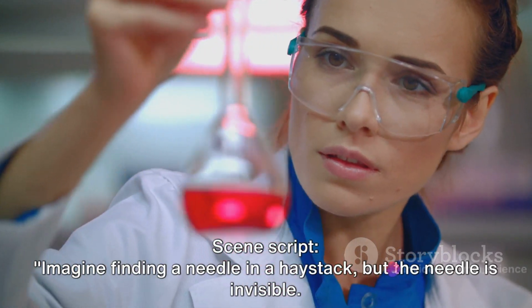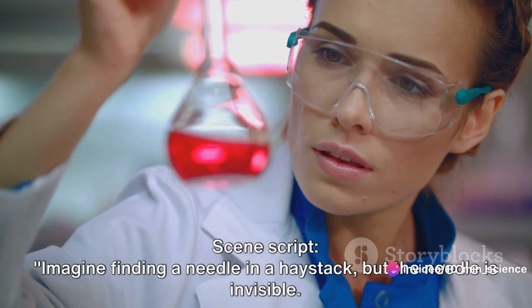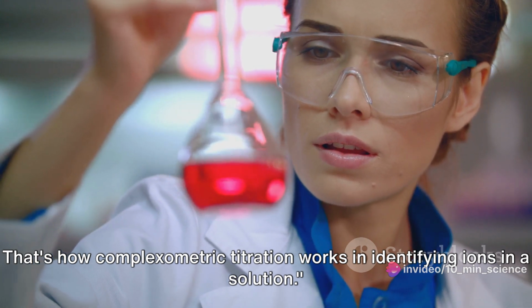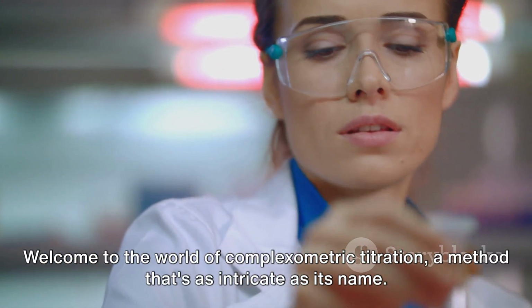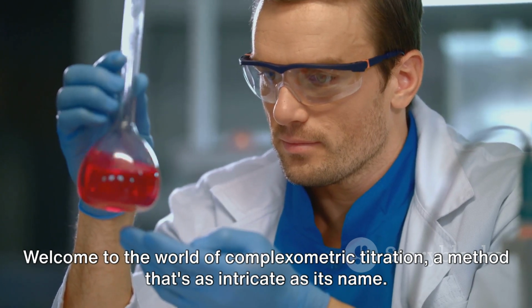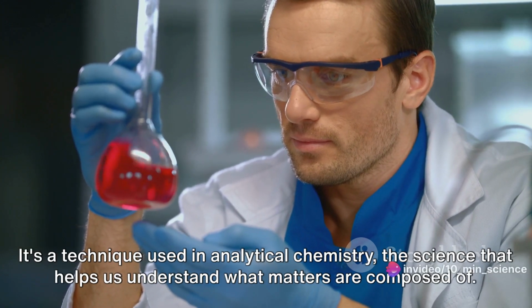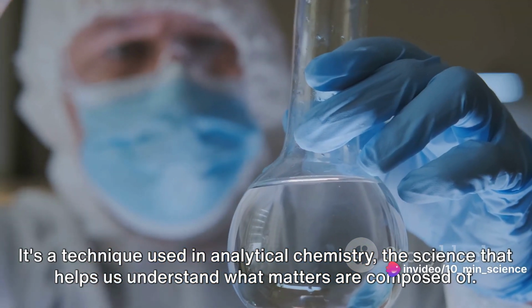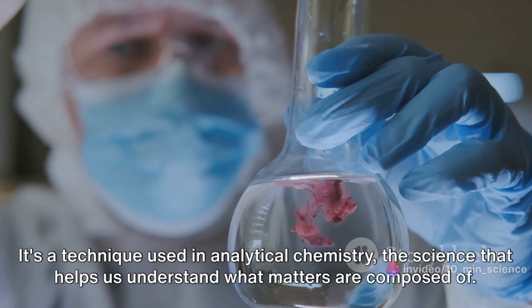Imagine finding a needle in a haystack, but the needle is invisible. That's how complexometric titration works in identifying ions in a solution. Welcome to the world of complexometric titration, a method that's as intricate as its name. It's a technique used in analytical chemistry, the science that helps us understand what matter is composed of.